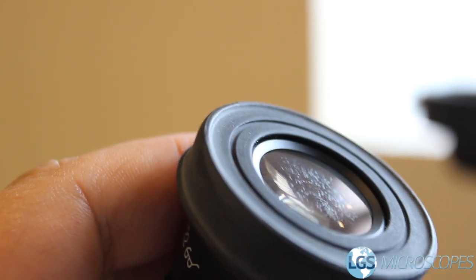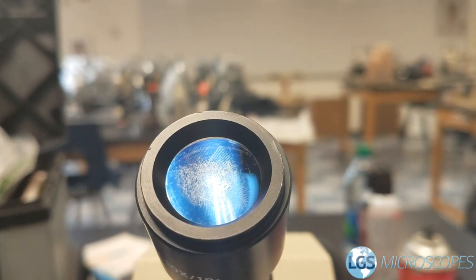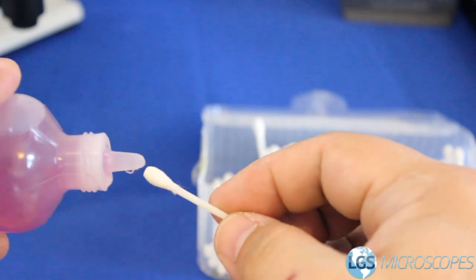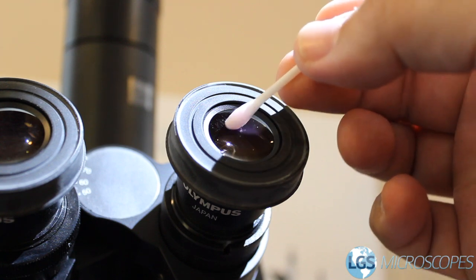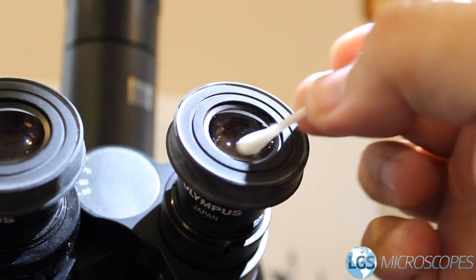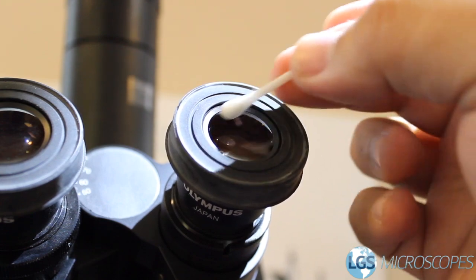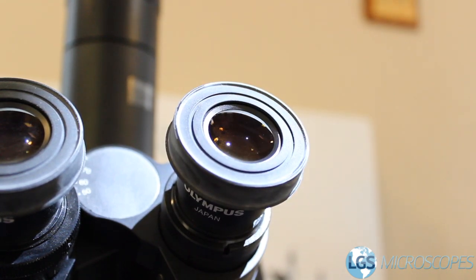That's the angle that you want to be using when you are trying to clean your eyepieces. If you don't have the option to pull your eyepieces out without using a tool, then you can angle your own head to try to catch the light. Once you've got an angle where you can see the mess on the eyepieces, go ahead and grab a q-tip, put one drop of lens cleaner on one side, and start from the center of the eyepiece wiping from the inside out in a spiral motion, then flip the q-tip over and dry it off. You also want to be twisting your q-tip as you go so that it's not all one side absorbing. You can watch as the lens cleaner dries up.